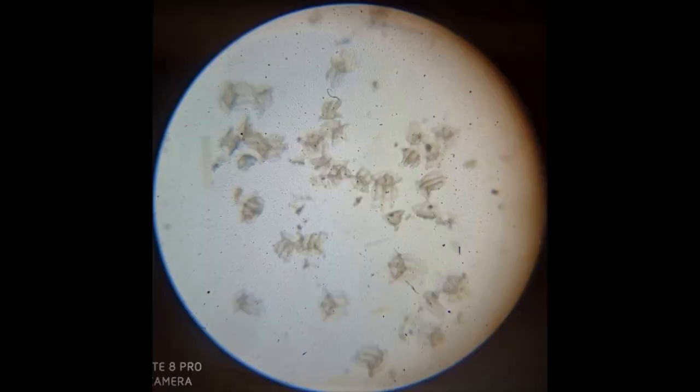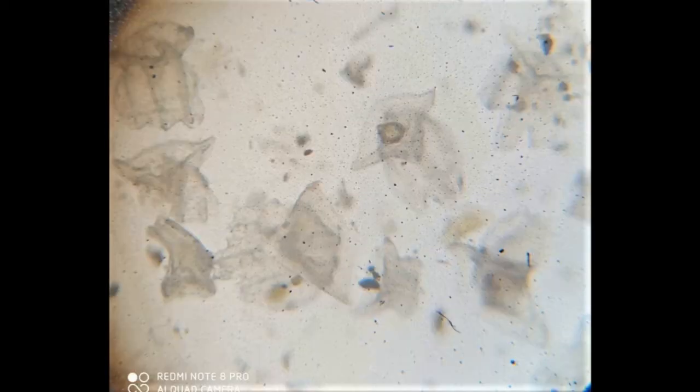Then we have to observe the slide under the microscope. This is the view under lower magnification — we can observe many placoid scales in the view. In higher magnification we can see the rhomboidal basal plate with centrally placed pulp cavity and the body with three spines. We can see the middle spine is larger. Pulp cavity contains live connective tissue and it is supplied with blood vessels and nerve endings.